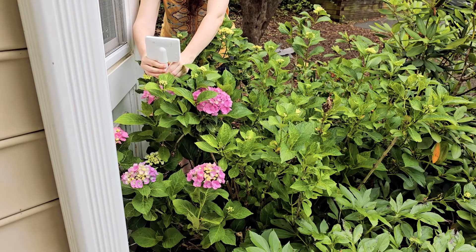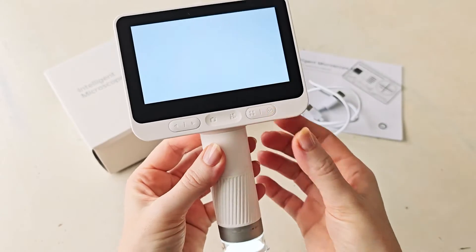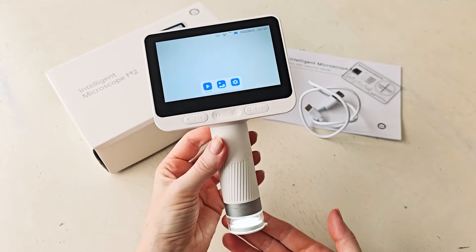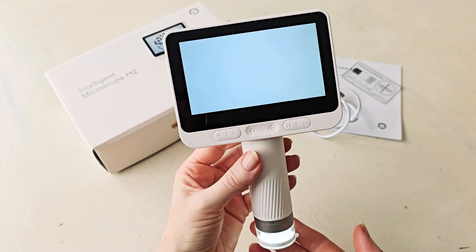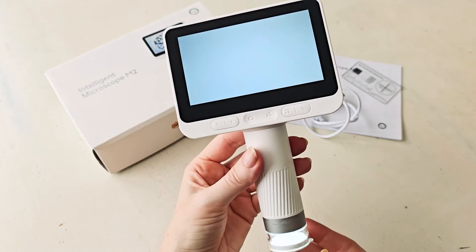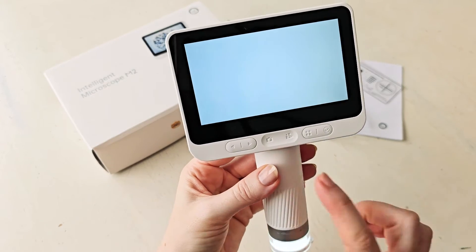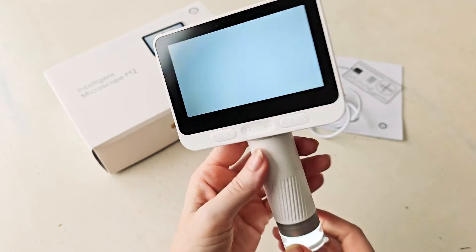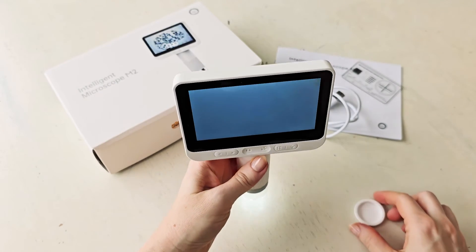Here I'm outside because what you can actually do with this is take photos and video with it. You can put it on top of things, and if you hold it very still, you can capture both photos and video that you can download. You can attach this to your phone or to a computer to get all of those files off, or to be able to view them. It's really well done, a ton of fun, and I think would make such a good gift.